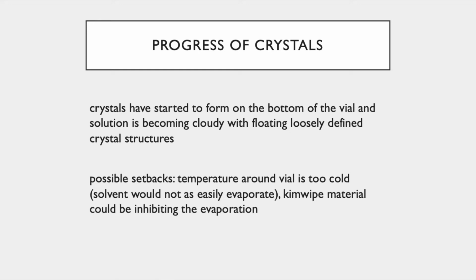I'm not sure if the development of my crystals is less than expected, but if it is, then there are some factors that could be hindering its growth. For example, in order for the solution to evaporate, it should be placed in an environment that will encourage evaporation. If the temperature around the vial is too cold, then it will make it harder for the solution to evaporate, and although the Kim wipe is in place to slow the evaporation process, it is possible that it has slowed it down too much.